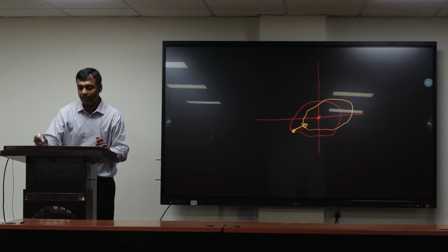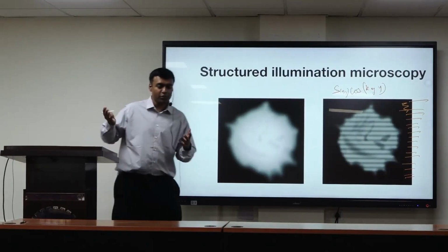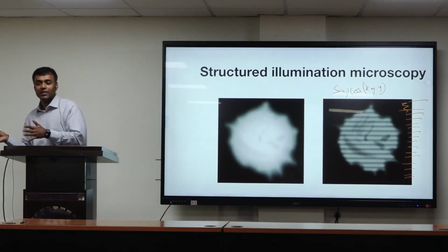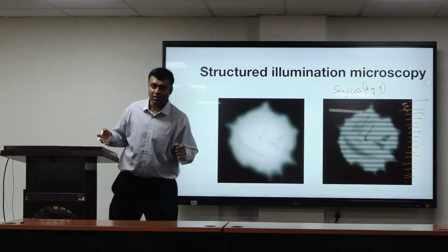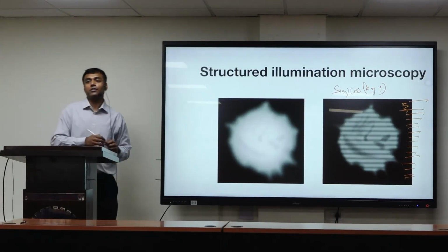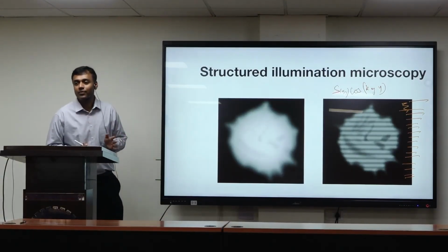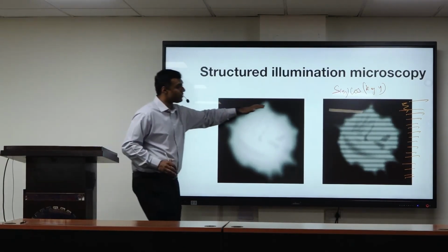And that's the idea. It's the same idea as one of the Fourier properties: multiplying by a cosine shifts frequencies. It's used in radio, in television, in our communication systems for what's called modulation, frequency modulation. So it's the same idea that people figured out in optics. You can do the same thing as well. So, multiply by cosine.